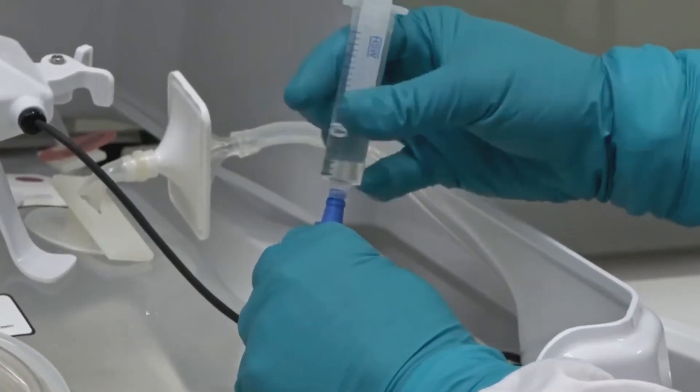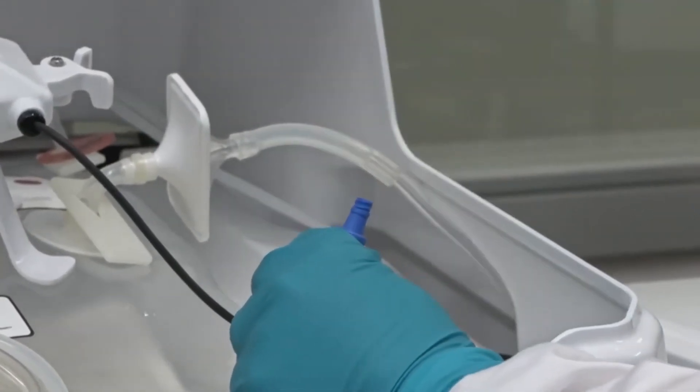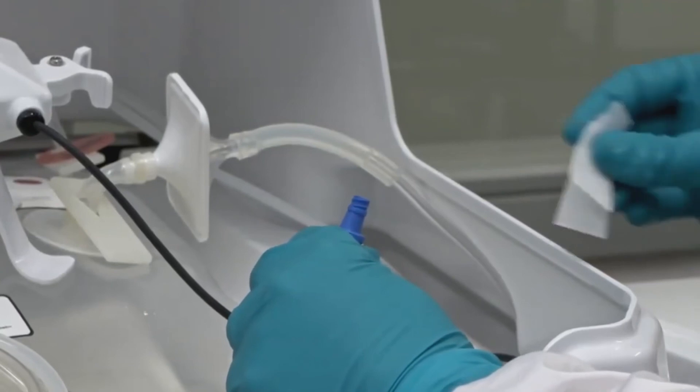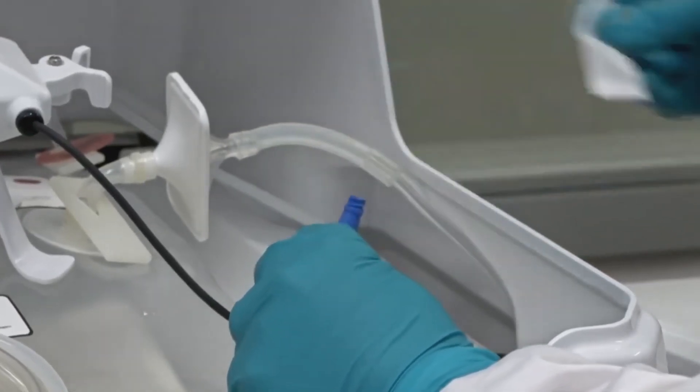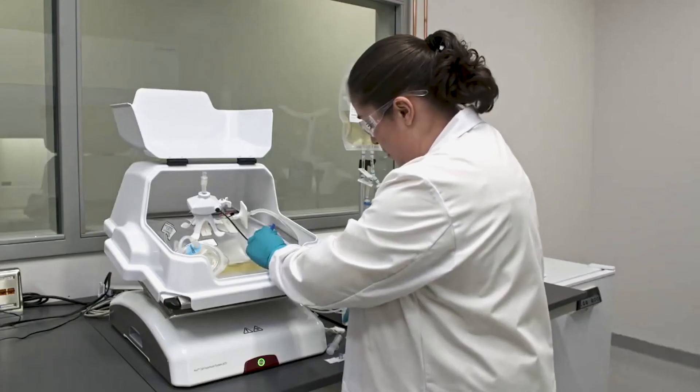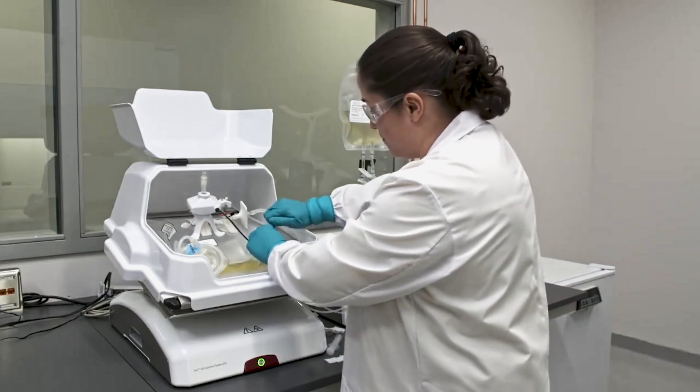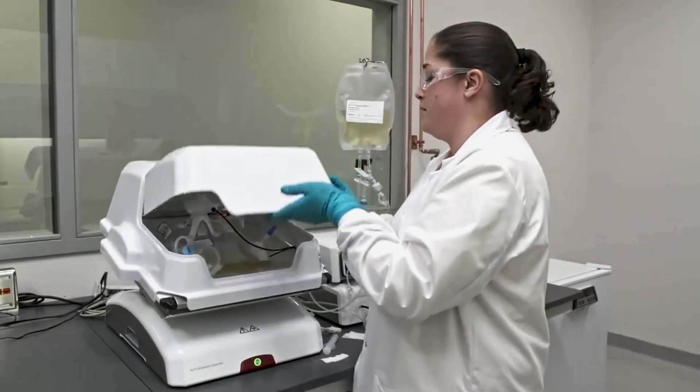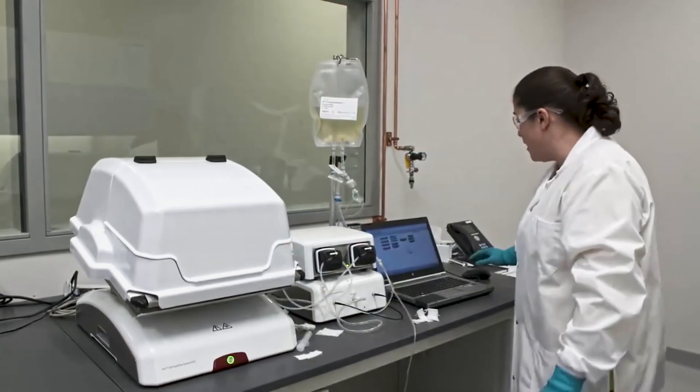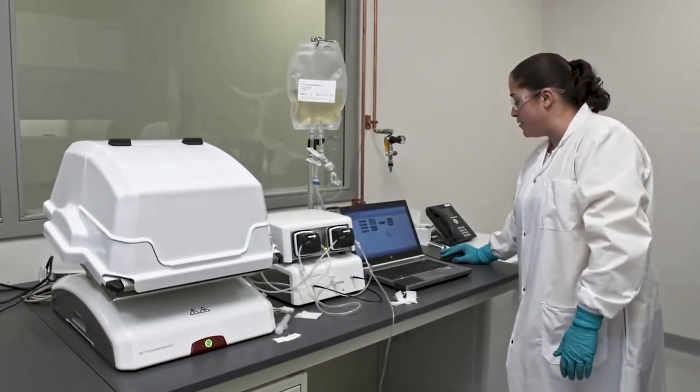Now remove the syringe, wipe the top of the clave port once more and put the cap back on. Close the cover and then click the pause button on sampling to continue rocking.